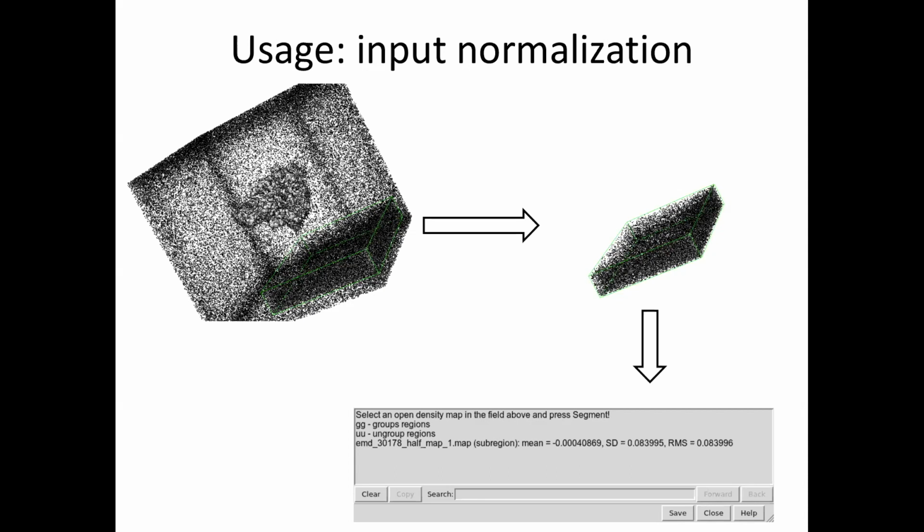Well, first of all, the noise is compared internally by the network. The noise at this stage is only used in order to normalize the whole volume. What we want is to scale the intensity values so that the proteins always look like they are in the range between 0.5 and 1.5 or so. So this is only for scaling. And providing your noise is consistent, this scaling should work, because we don't really care about the noise, but the protein. Trying to learn what is noise and what is not is way more complicated than trying to learn what is protein and what is not. The only thing we need the noise for is to make sure that the scale of the intensity values is the same as the one we use for training.